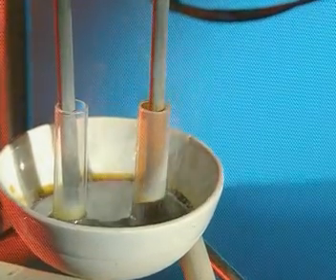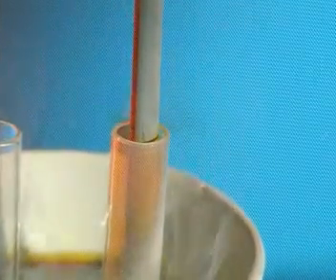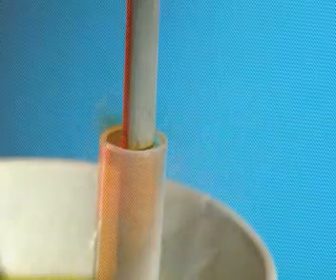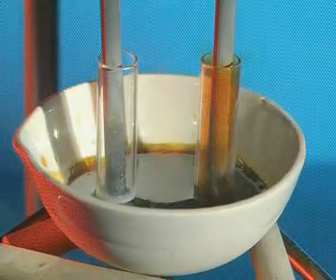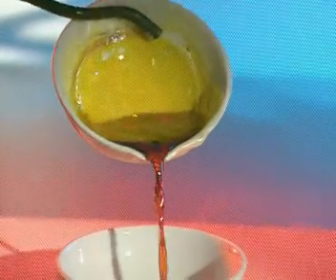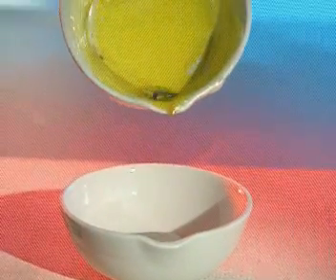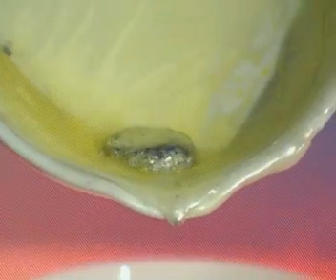What could the brown gas be? The gas is bromine. Although nothing obvious appears to be happening at the left-hand electrode, pouring the molten lead bromide away reveals a small silvery metallic bead. This is pure lead.